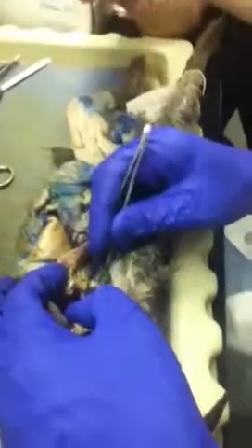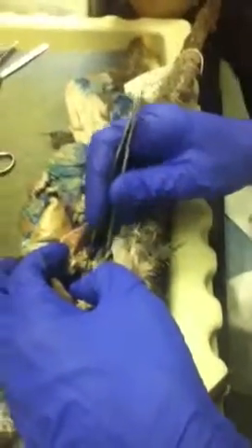As you'll recall, hepatic portal is bringing blood to the liver, and if we get lucky in here, it's in here somewhere. The bile duct is in here also. That's probably hepatic portal right there.